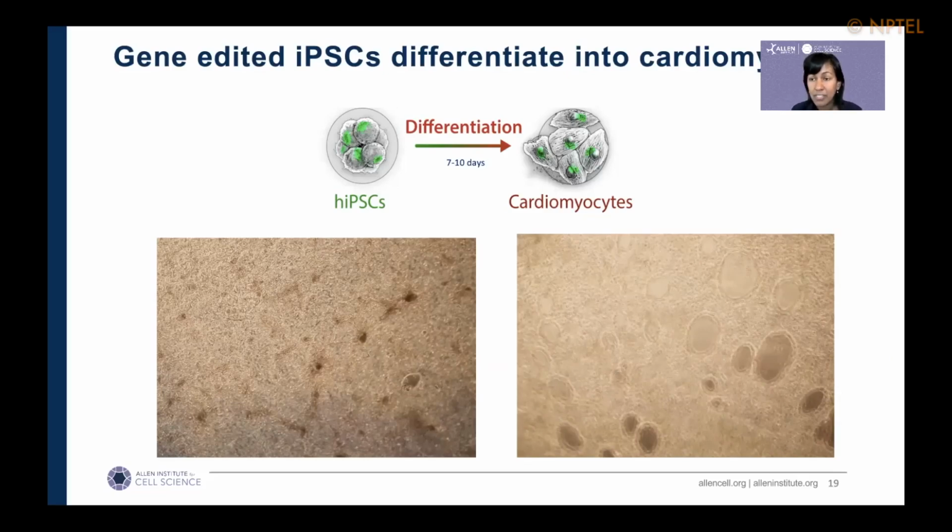And again, these details and protocols are on our website. So we've done this. We do this as part of our quality control when we make a gene-edited cell. So I'll show you two examples.